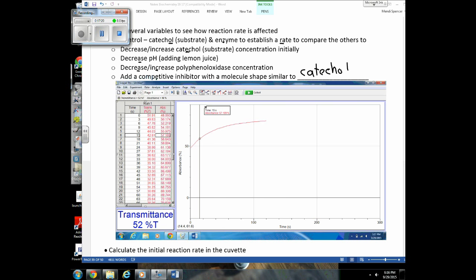This screenshot shows the Logger Pro program we're using to collect data. I want to emphasize the need for speed in this lab. You'll mix your catechol with water — the reaction won't start until you add the enzyme. Once you add the enzyme, be very quick: do five drops of enzyme, cap the cuvette, invert it once, and quickly put it in the colorimeter. As soon as the lid is closed, hit the green triangle start button. You may be asked to save your data set — click to save it. Time is of the essence because we need to capture the initial reaction rate.